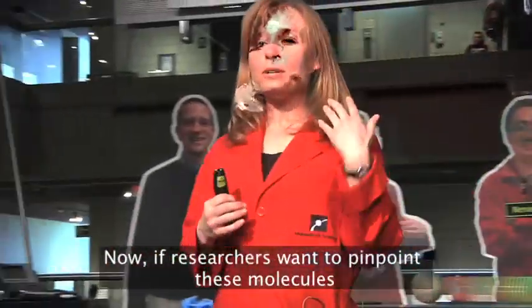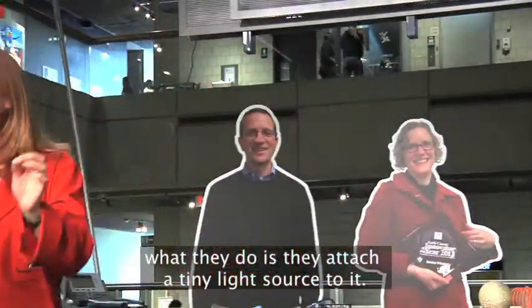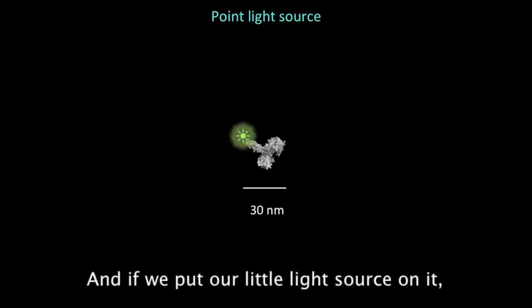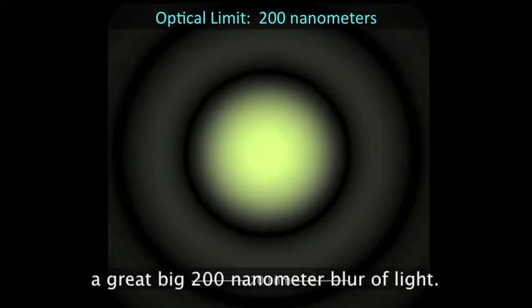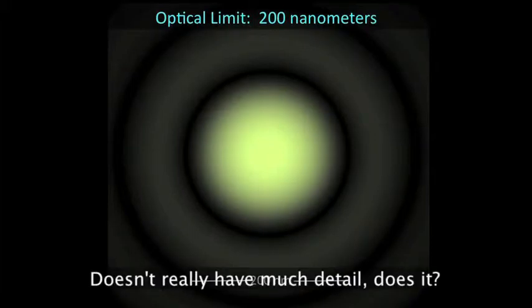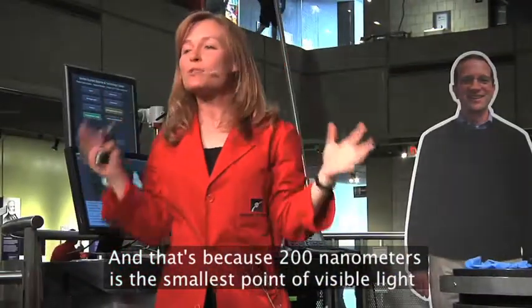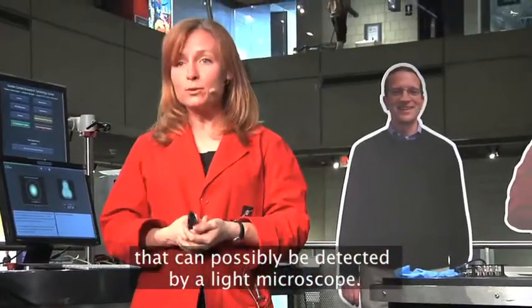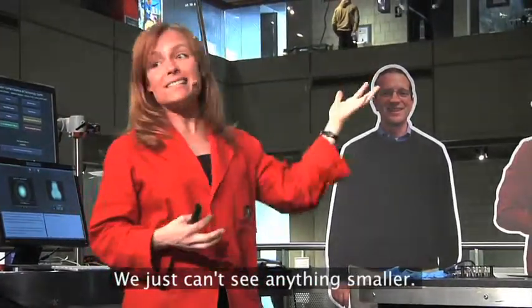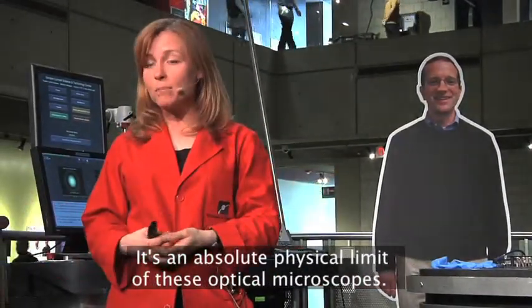Now, if researchers want to pinpoint these molecules, what they do is they attach a tiny light source to it. And if we put a little light source on it and look at that under a microscope, we'd see this. A great big 200 nanometer blur of light. It doesn't really have much detail, does it? And that's because 200 nanometers is the smallest point of visible light that can possibly be detected by a light microscope. We just can't see anything smaller. It's an absolute physical limit of these optical microscopes.